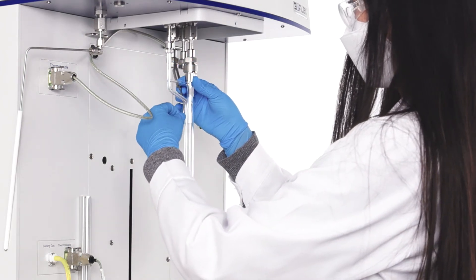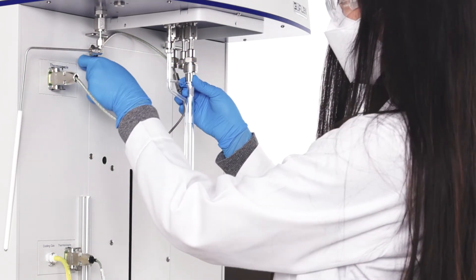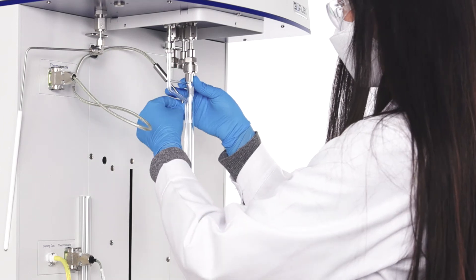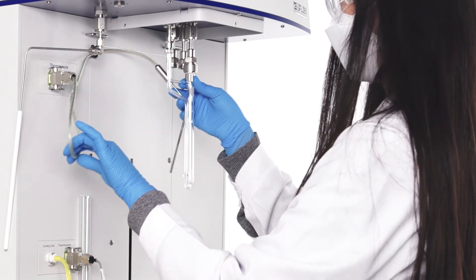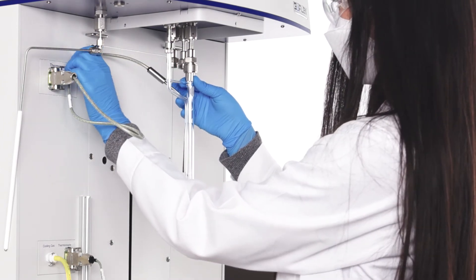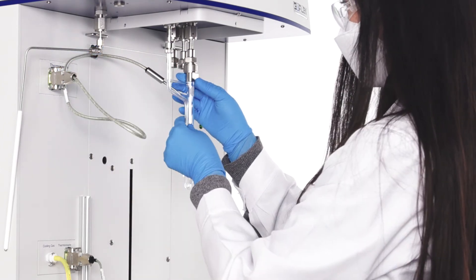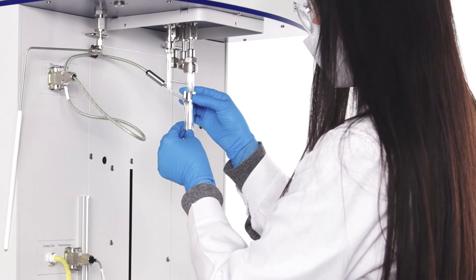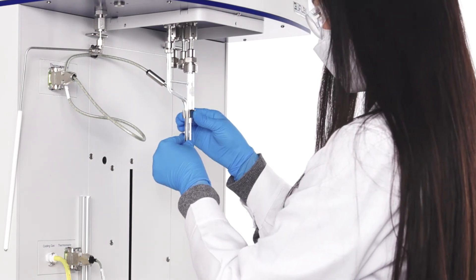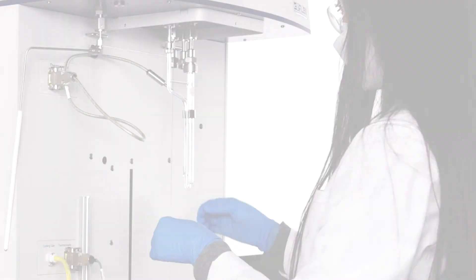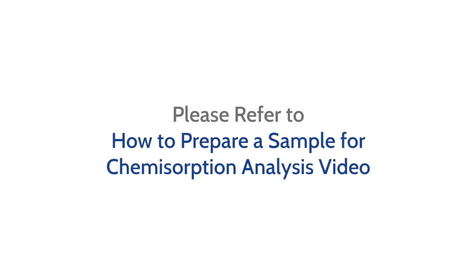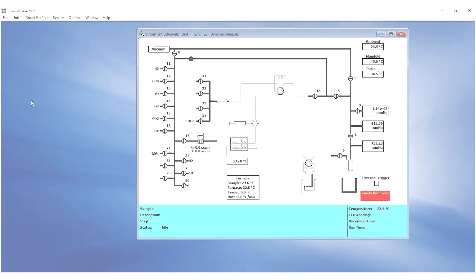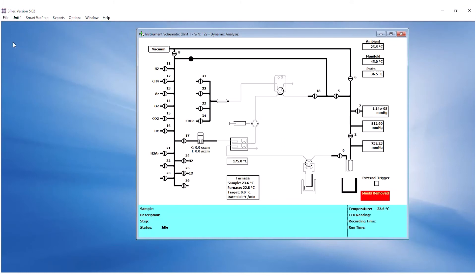Attach the thermocouple to the sample tube with the provided clip. For more detailed information, please refer to the 3FLEX chemisorption sample preparation video.